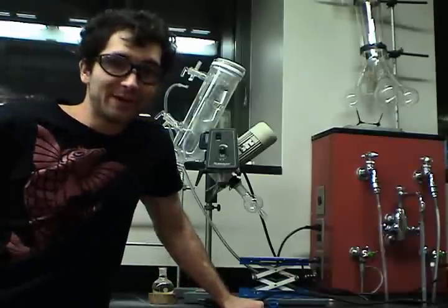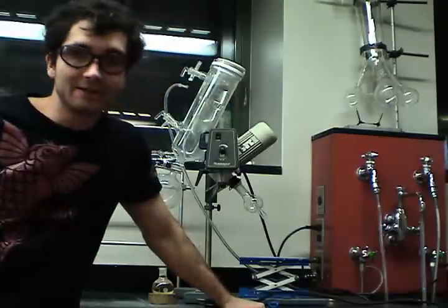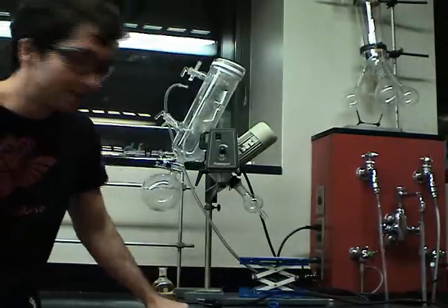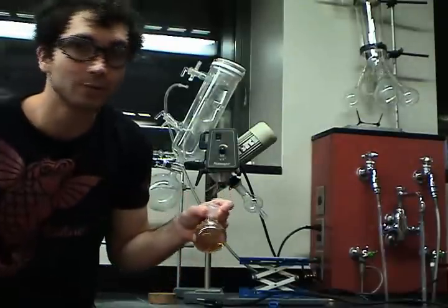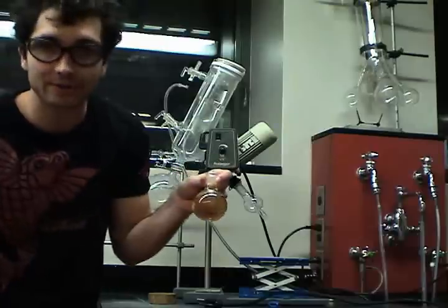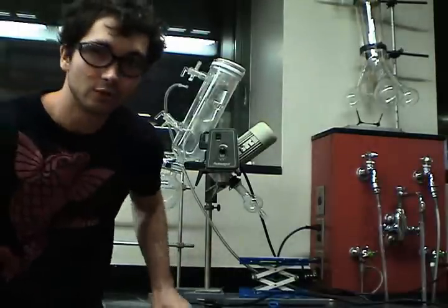Hi Chemistry Lab! For my final video, I would like to detail for you how to use the Rotary Evaporator — this illustrious machine behind me — or Rotovap, as it is affectionately known. This machine's basic purpose is to separate a volatile solvent from the liquid or solid solute that is dissolved in it. So we are going to separate this acetone from the yellow compound dissolved inside. We could wait for this to evaporate, but that's tedious. So we have the Rotary Evaporator to do that for us.